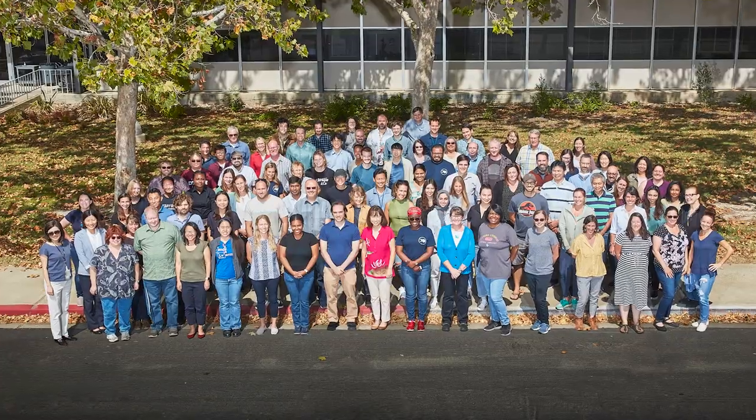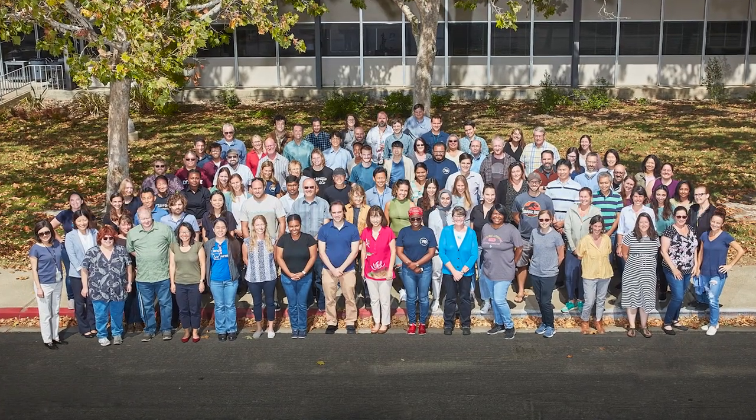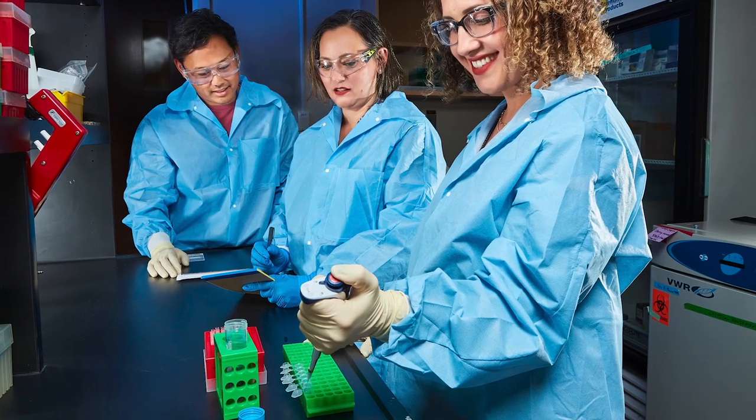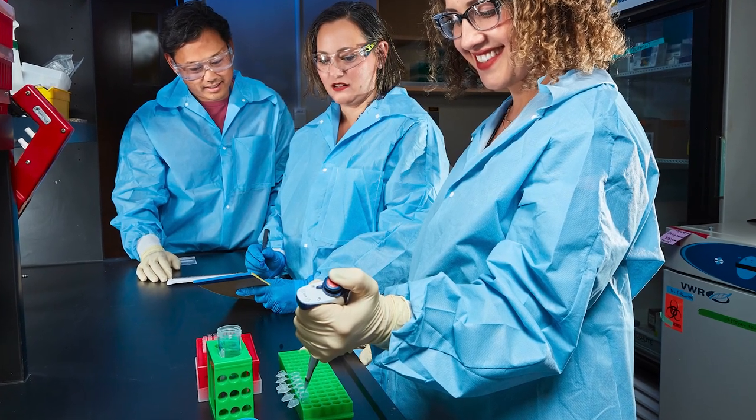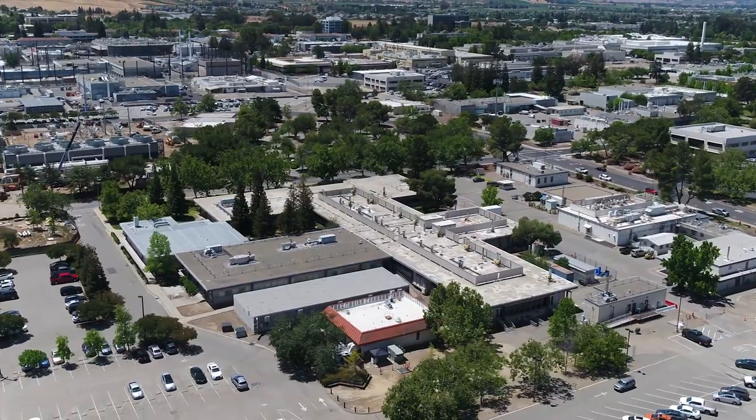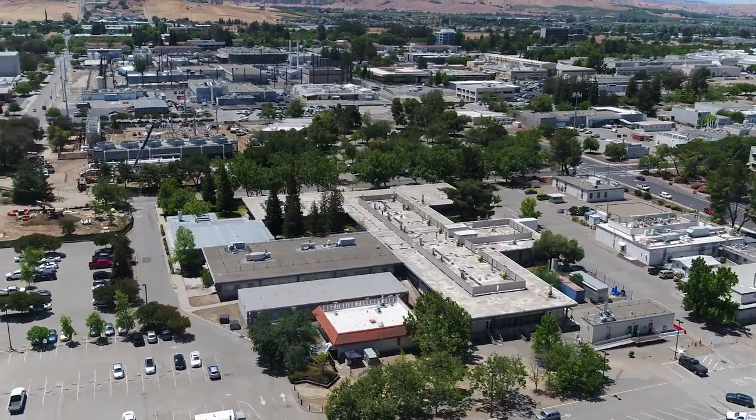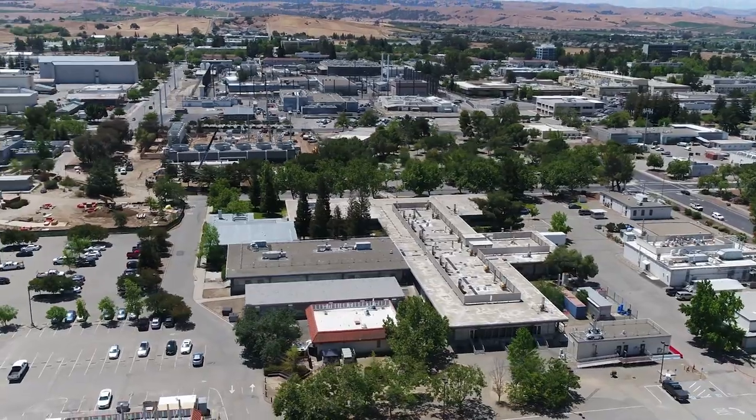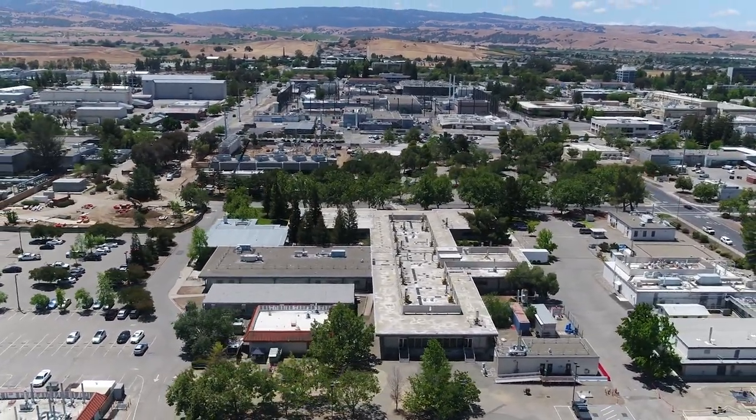To support the experimental research, the Biosciences and Biotechnology Division Building 360 complex houses the cornerstone facilities for advanced biological research at the laboratory. It consists of six buildings and over 70,000 square feet of laboratory space. The complex is part of a larger infrastructure that fosters a safe and secure environment for collaborative, innovative, basic, and applied sciences that address complex challenges.